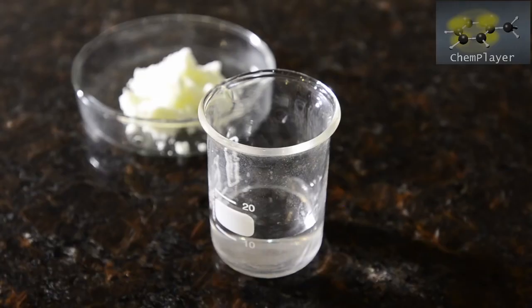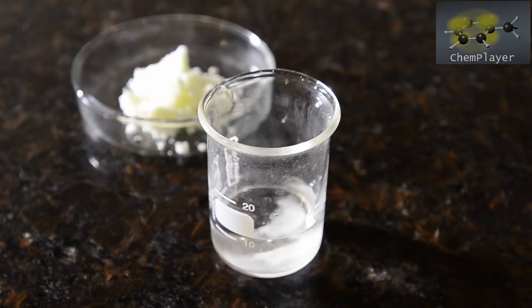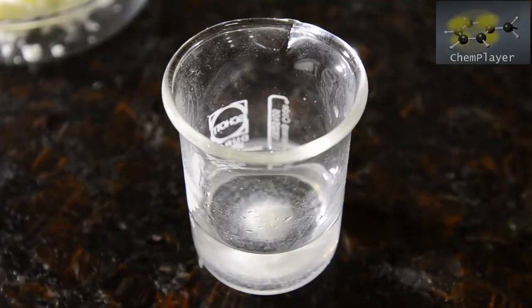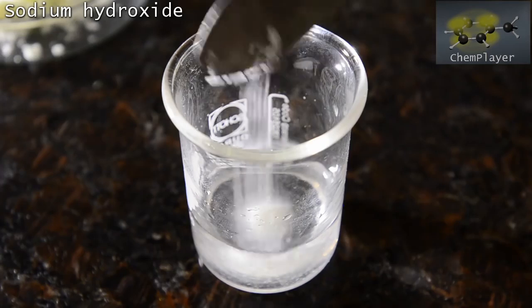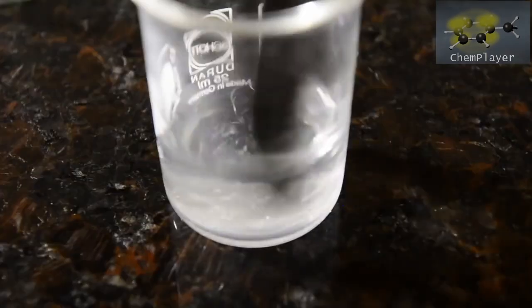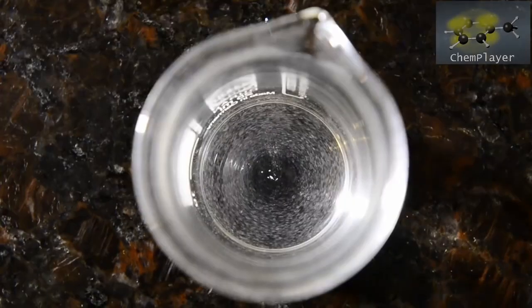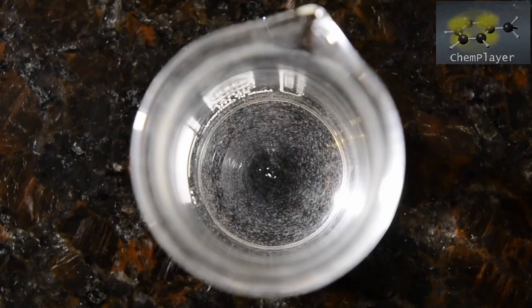Here's a small amount of water in a beaker. Let's add some of the product. Some dissolves, but as you can see, it's not that soluble. Now let's add a little bit of sodium hydroxide. Now the solid dissolves, forming the sodium salt of barbituric acid in solution.